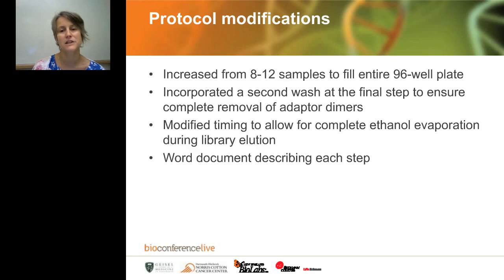And I didn't mention before, but we actually didn't have to modify the NEB protocol at all. The one that Sarah produced for us worked very well, so there were no modifications on that, but it was a little bit more of a straightforward protocol to automate.